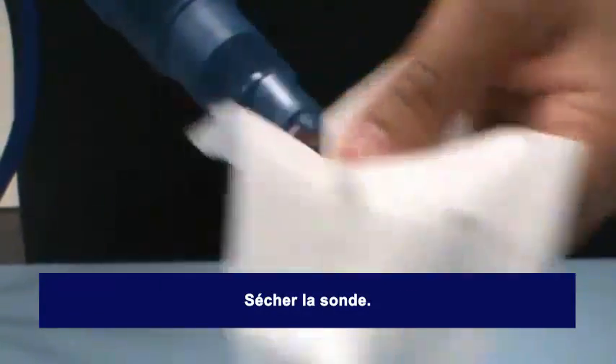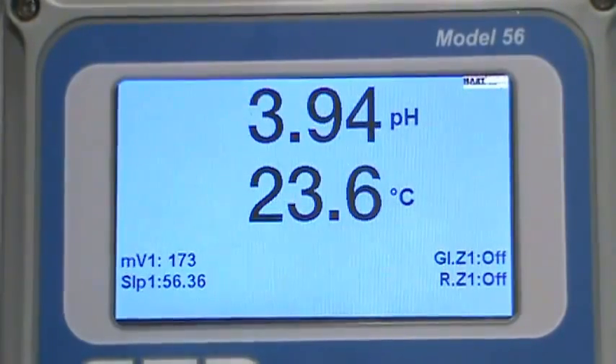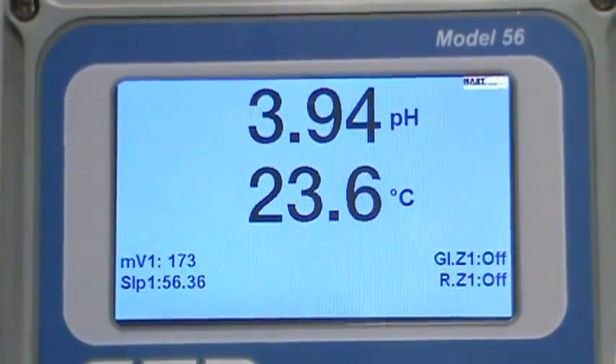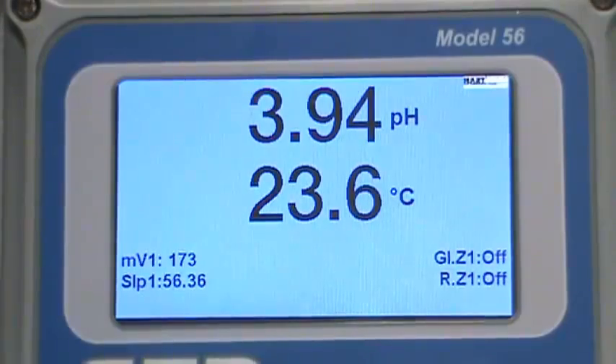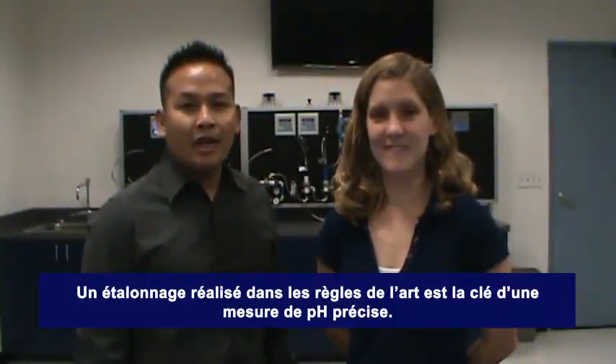Dry the sensor with a soft cloth or tissue. If the sensor is calibrated successfully, the instrument will not display any error messages. The sensor can now be placed back into service. And that's how you calibrate a pH sensor.